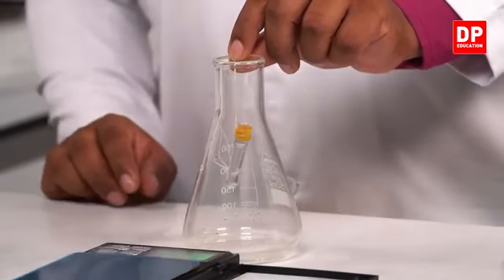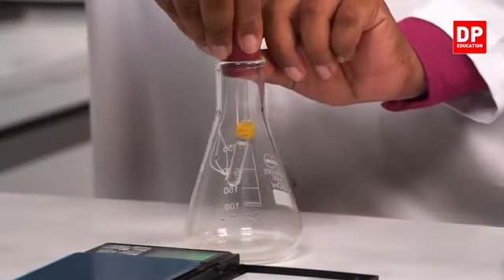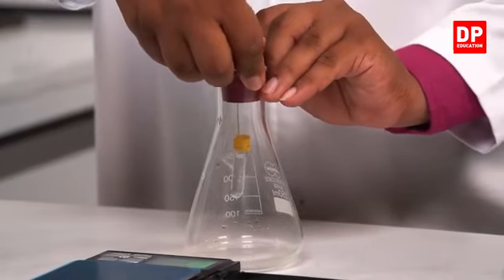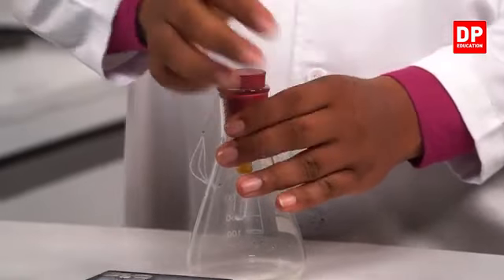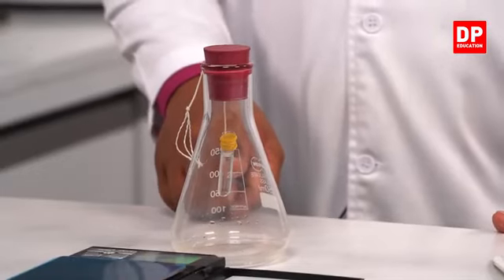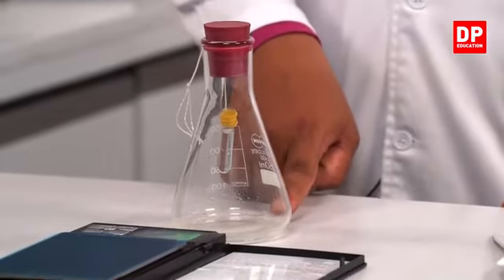Right. So I'm going to keep it in this position, and I'm going to insert the cork very well so that it seals up. Make sure to seal the system very well, because I told you that it should be an enclosed system. It should be a closed system. So this is my system now: the ignition tube which contains sodium chloride, and the larger vessel, which contains lead nitrate.